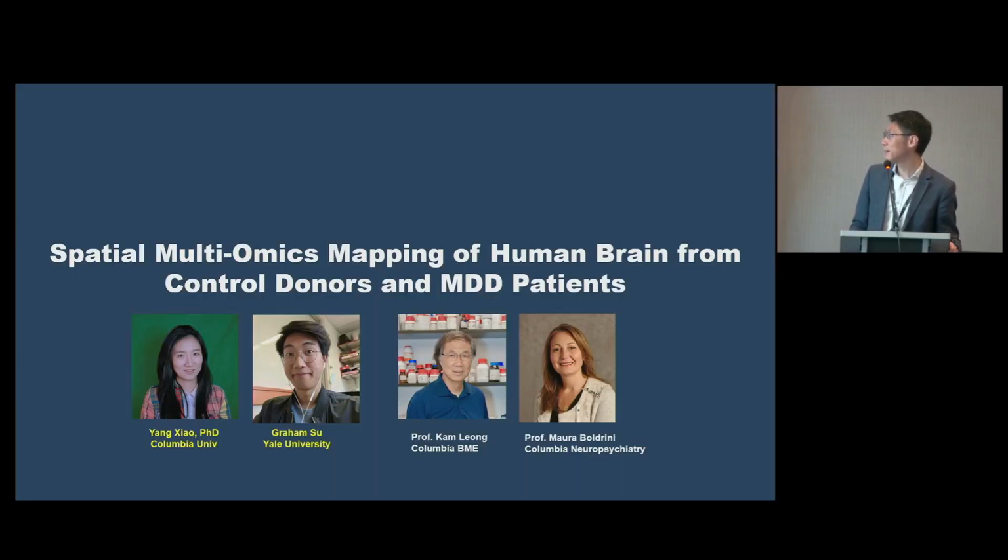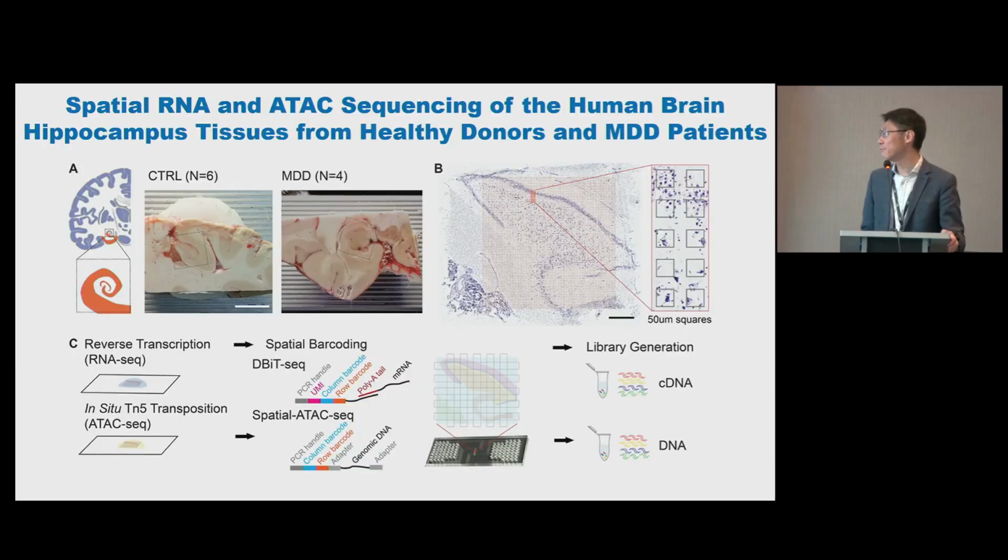So just a little bit about what we believe: I think the real power, going beyond what we do in my laboratory, is sequencing. I love imaging, as I said, and I think that's one of the two major categories. But I believe the real power comes when we combine imaging and spatial transcriptome or spatial multi-omics. This is a beautiful work done by a former graduate student, now postdoc at Columbia. They mapped out the human brain hippocampal region, and I think the data is updated now. This is 16 human brains. I believe 6 of those are from very saddening stories.